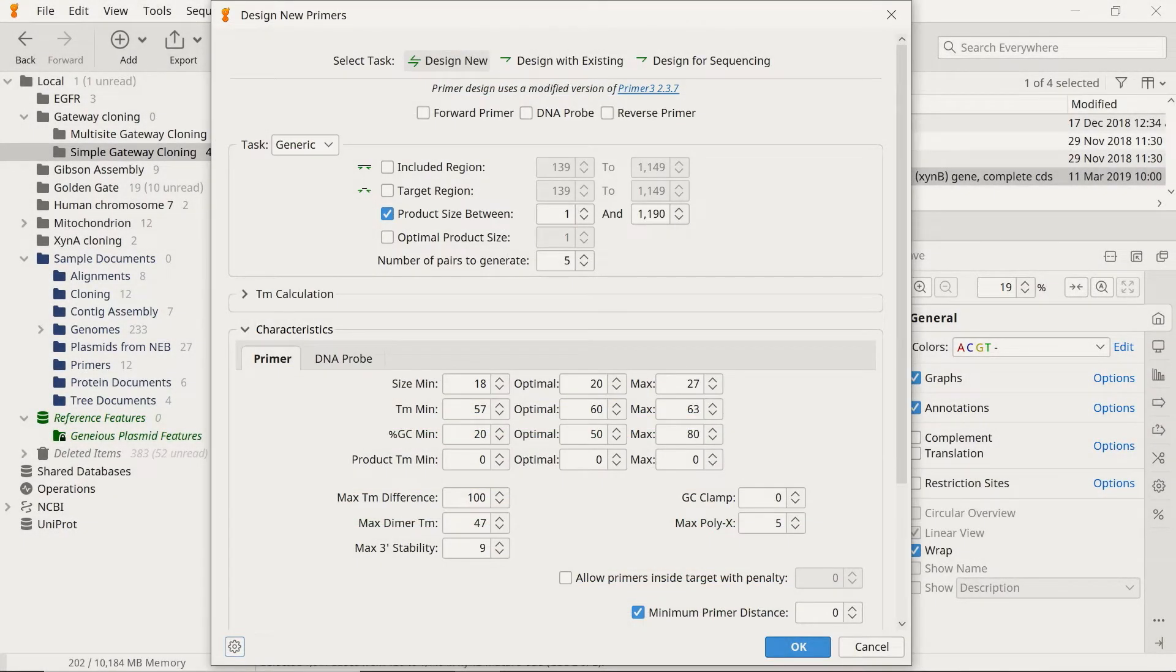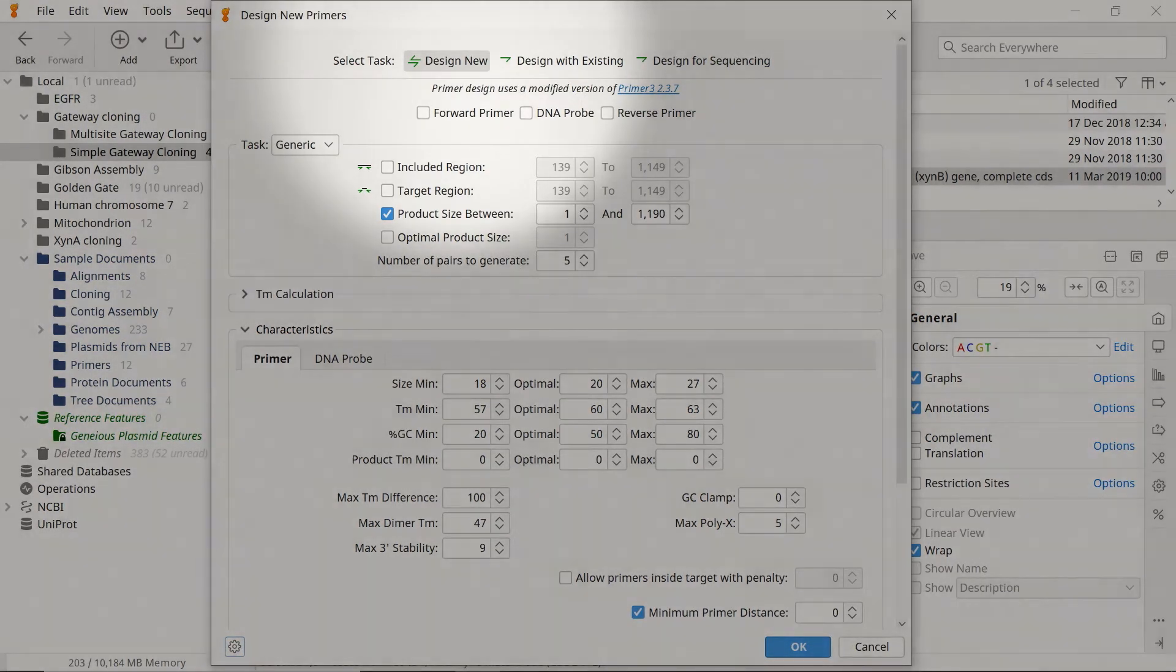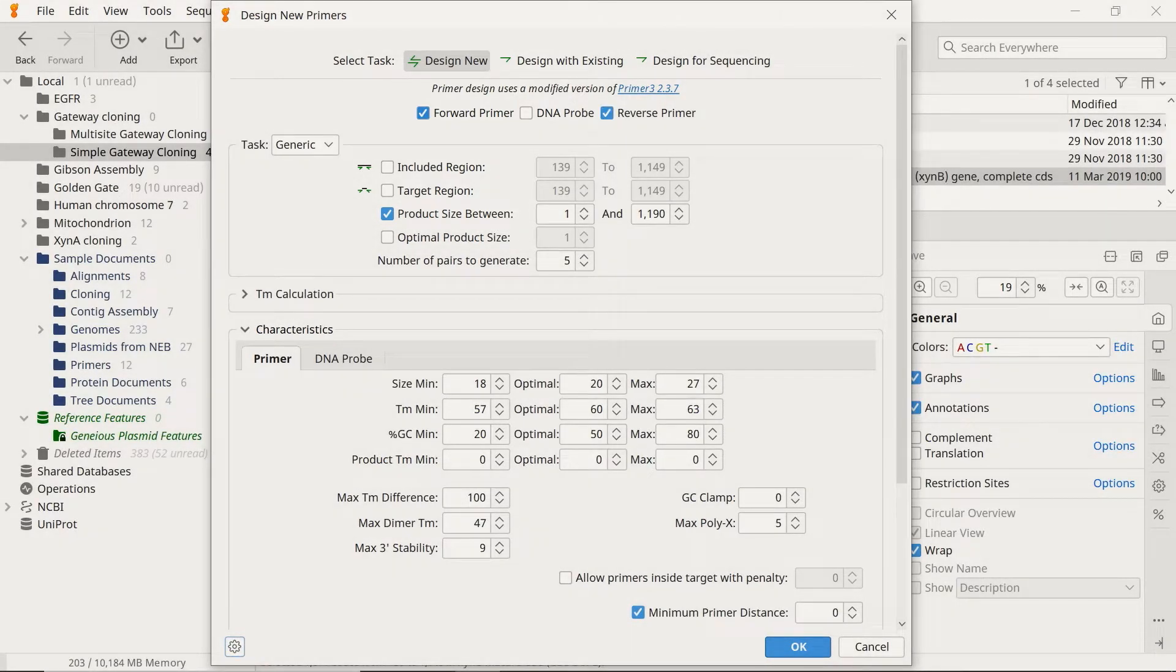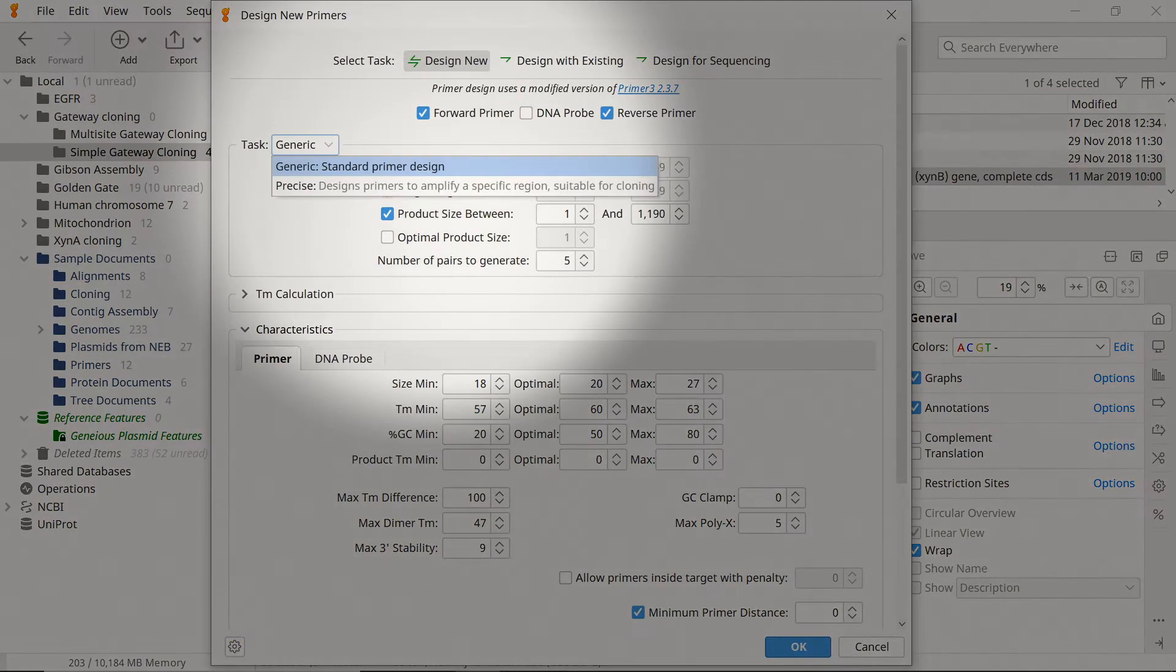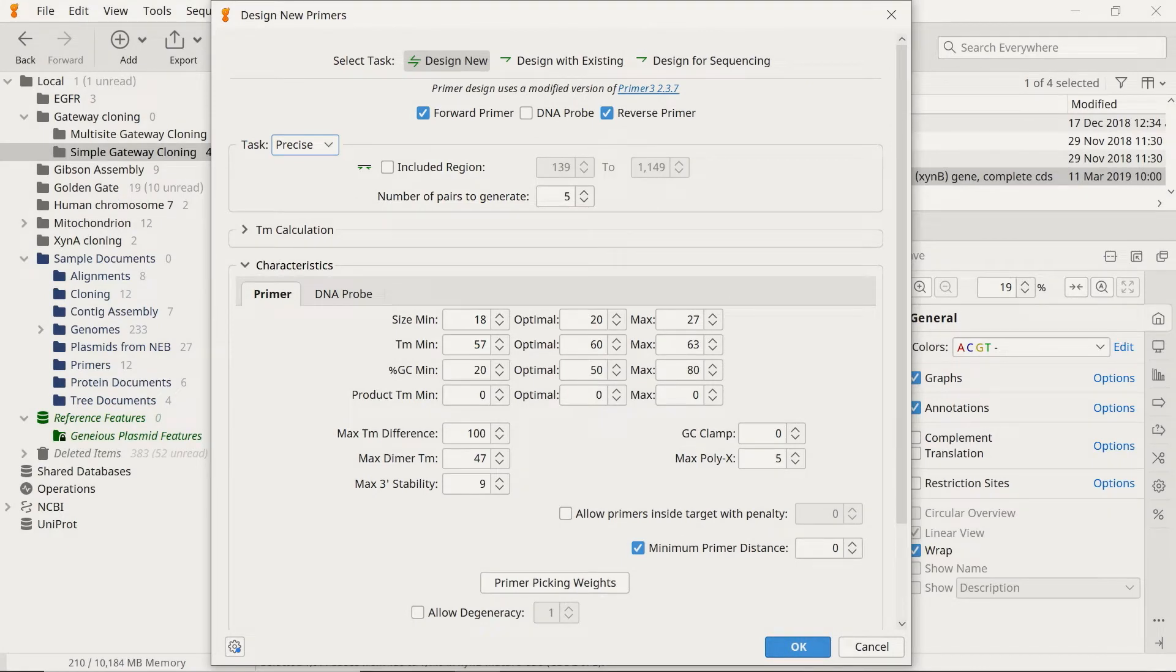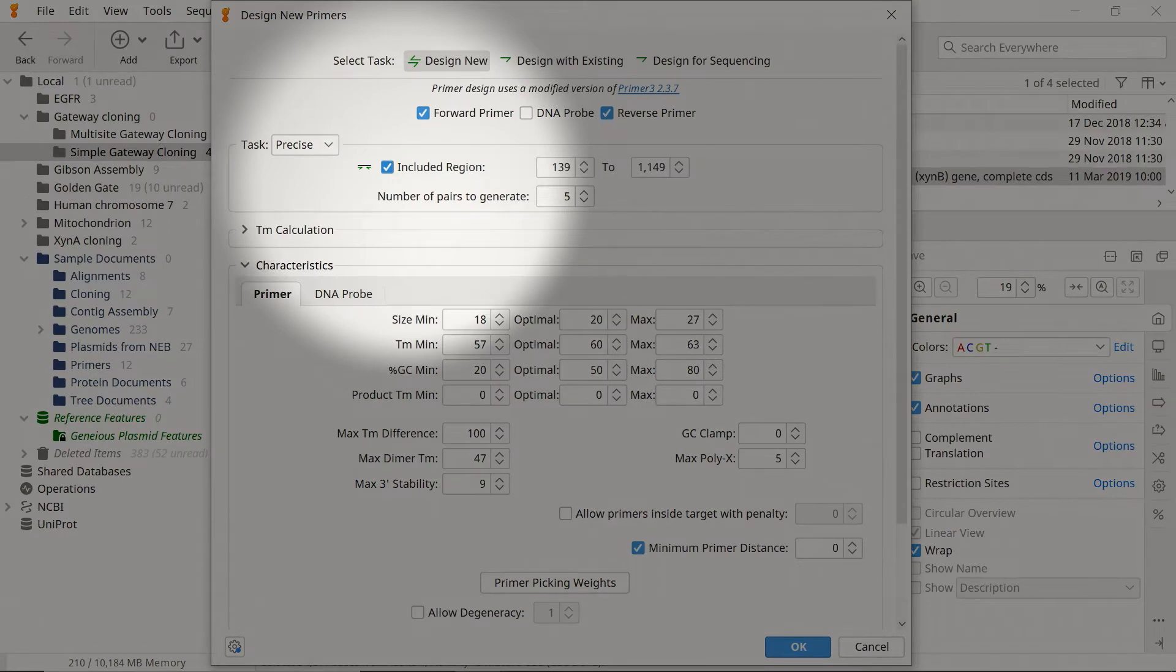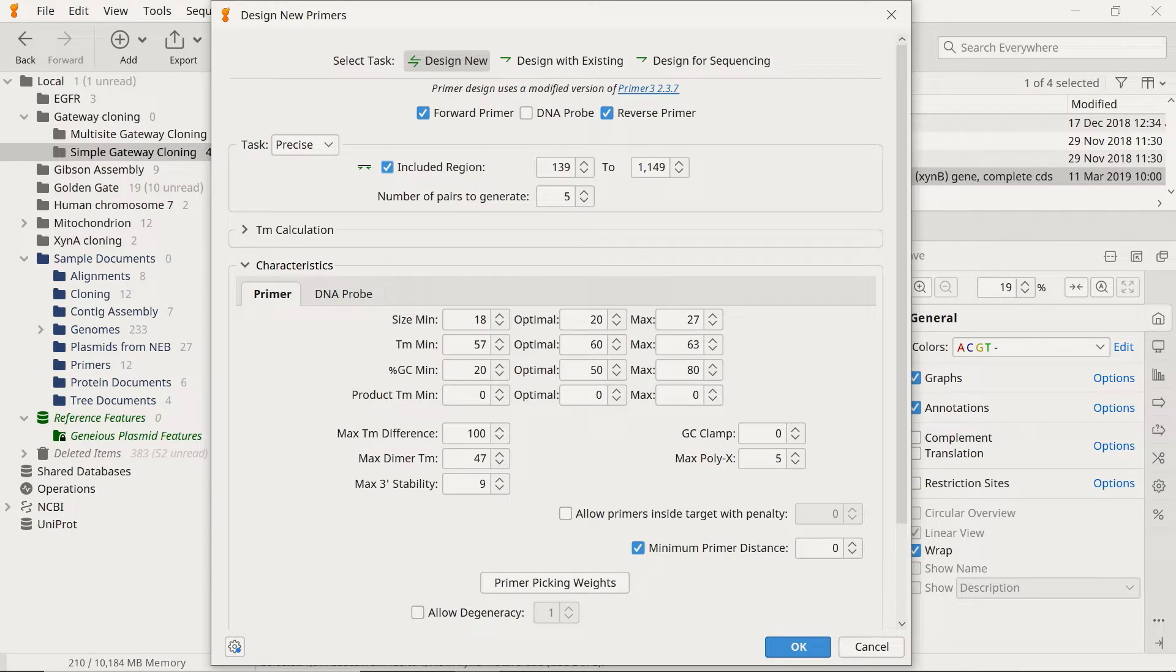In the Design New Primers window, select Design New to create custom primers. Tick Forward and Reverse Primer. There's no need for a DNA probe in gateway cloning assays. Because we want Genius to amplify a specific region, change the task to Precise. And since we selected the region of interest before opening the Design New Primers window, we can check the Included Region option here.